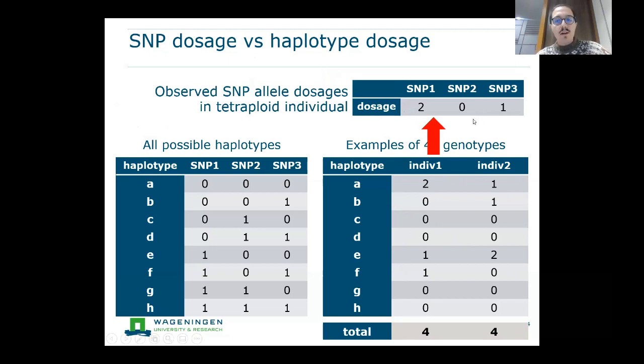So if you look only at the SNP genotype, you will see that for both of them, they have 2 times the reference allele in SNP1 and 3 times in SNP3. Now, this is the core problem of haplotyping, right? You end up having multiple individuals with similar dosages, but that underlie different haplotypes, and that's what Polyhaplotyper is trying to solve.